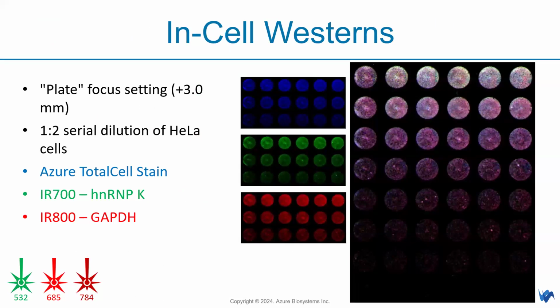the Sapphire FL. By performing the in-cell Western on a 96-well plate, you can accurately measure intracellular protein expression in situ, within the cells, without changing much of the environment. This is a very high-throughput methodology. You can assess multiple stimulations, endpoints, proteins of interest, or even time points, depending on your experimental design. And you can have replicates. Unlike on a Western blot, where maybe you can do 1 or 2, you can have more replicates for every single group.